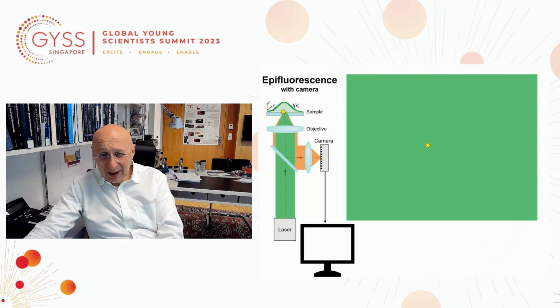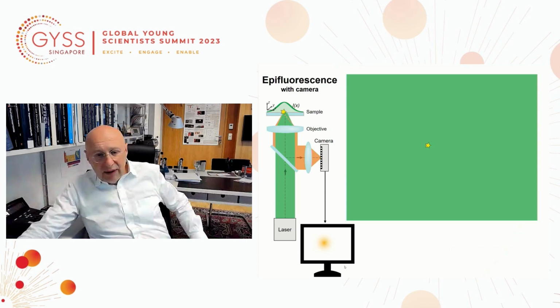So what is usually done is that the fluorescence emitted by the molecule is collected. It is focused onto a camera, the one that you see here, with many pixels, and then what will be produced on the camera is a blob of light. The blob of light will be nothing but the fluorescence diffraction pattern produced by a single molecule. So because fluorescent light is diffracted as well, we get here a blob of light that is relatively wide.